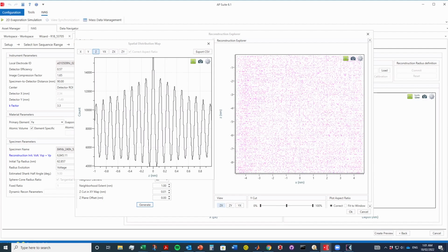Very impressive work. And I was just wondering, when you decide the location of the detector of individual peaks, you're just roughly estimating by moving your mouse over the pole. Do you have an idea how much this really changes if you are not really in the center, or is it fairly good enough to just have this rather rough estimation?